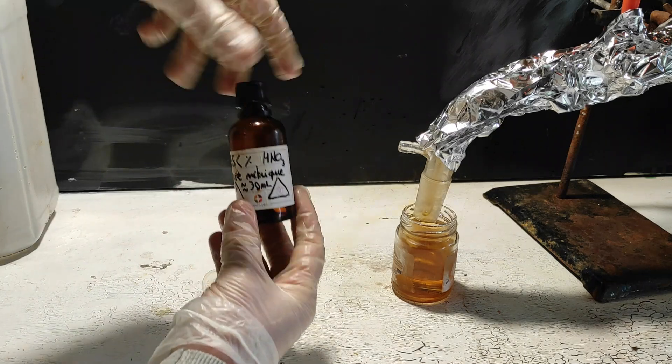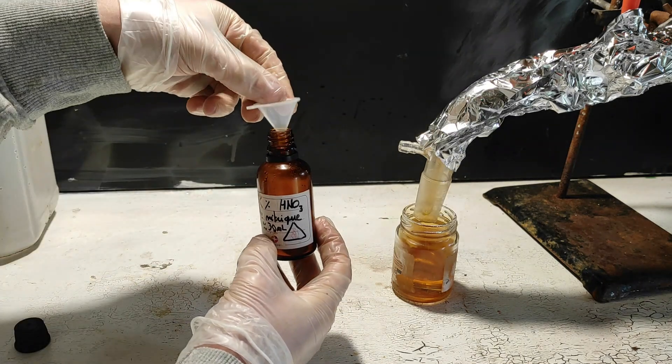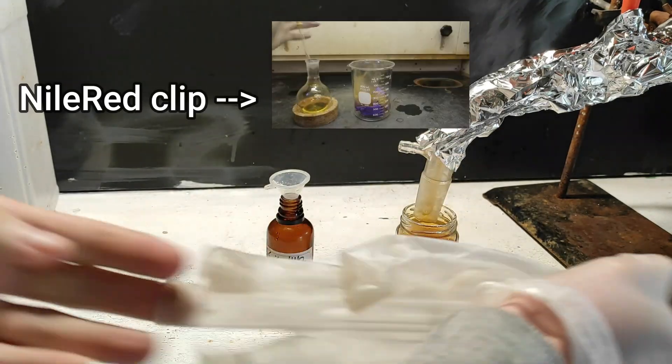When the distillation stops, we can store our concentrated nitric acid in a brown vial. Make sure that you either don't wear gloves or that your gloves can handle concentrated nitric acid, because most gloves will catch fire upon contact with it.